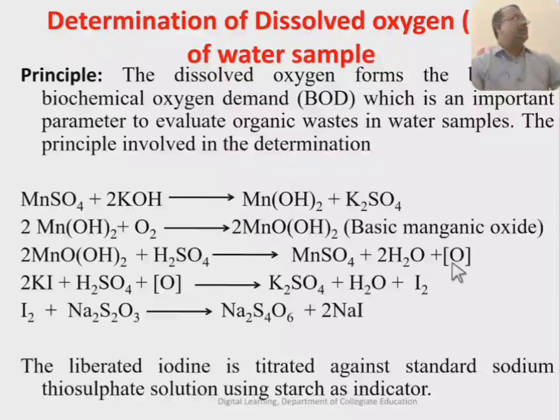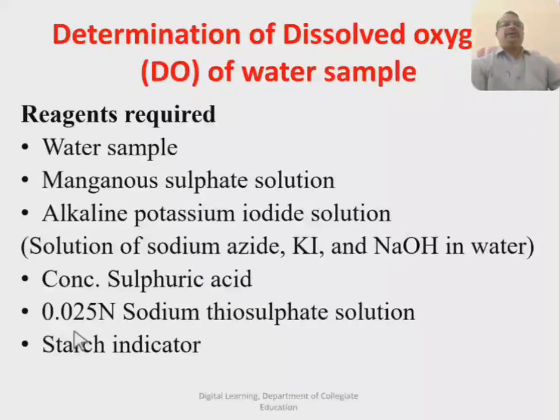This oxygen reacts with potassium iodide and liberates iodine. The liberated iodine is titrated against standard sodium thiosulfate solution using starch as an indicator.